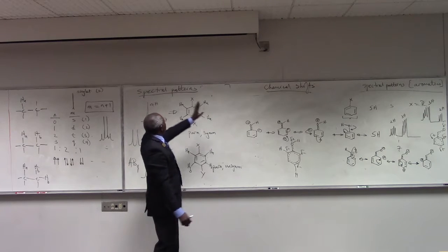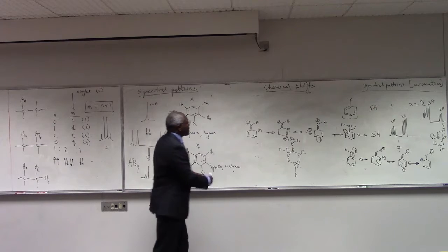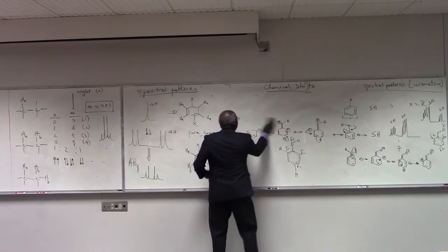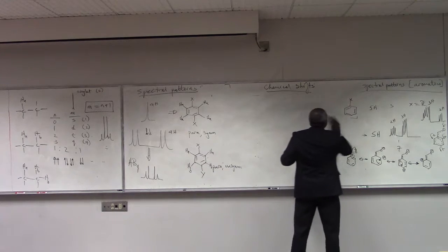Okay, so we have spectral patterns that are aliphatic, spectral patterns that are aromatic, and the last thing we do is look at some special chemical shifts that reoccur.